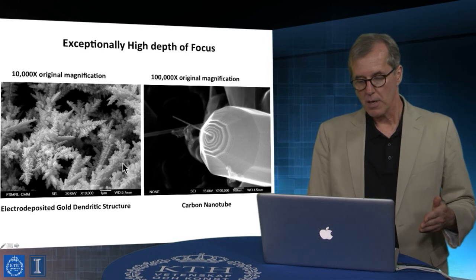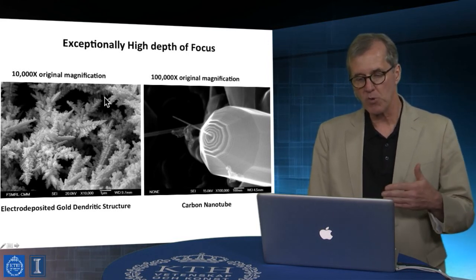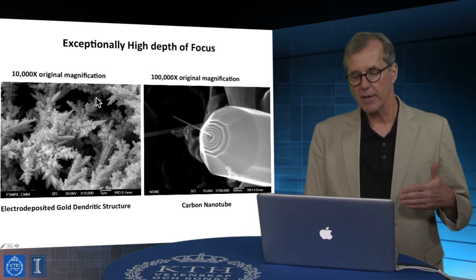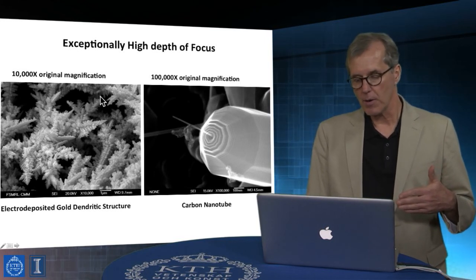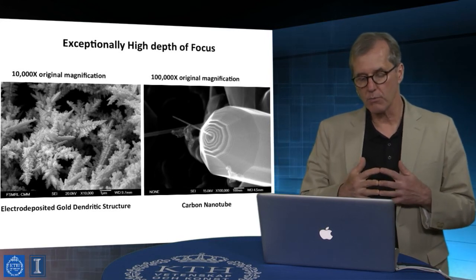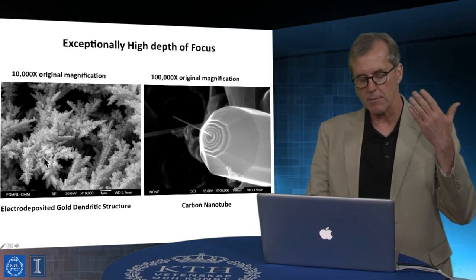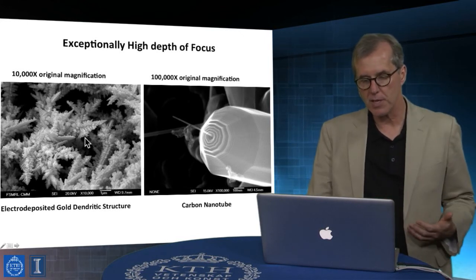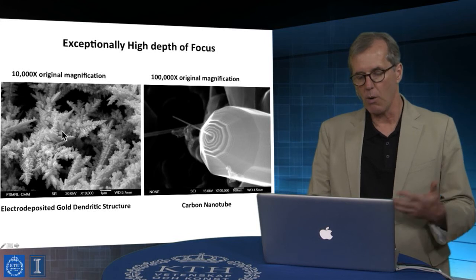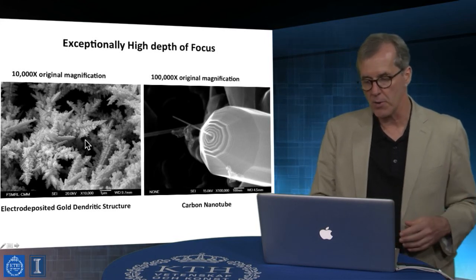But again, this is a 1 micron scale bar in this case, and we can see structural features approaching nanoscale dimensions, but very high resolution and enormous depth of view, right? We're looking at many microns deep into the material, and all this is beautifully in focus.